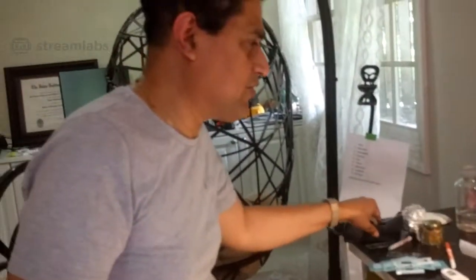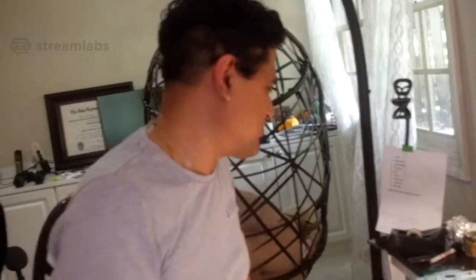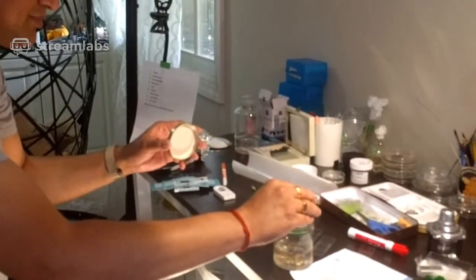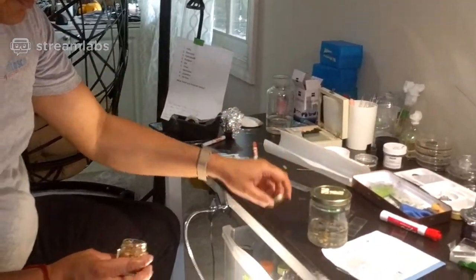Usually, I love to use my Bunsen burner. I don't think I'll turn it on today. That's too much of a show. What you do is take a couple of grains, dump it in. In reality, I have just used 2 grains to grow things.